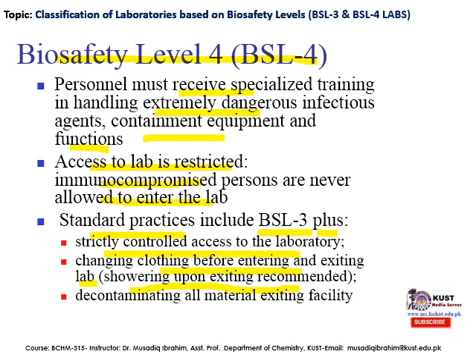And also decontaminating all material exiting the facility. So you have to decontaminate all the areas of the lab which you have touched or handled, so that there is no chance that some infection might spread within the labs or in the premises of the BSL-4 lab.